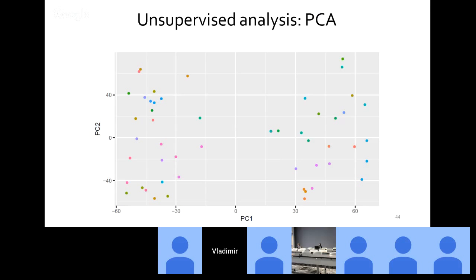And interestingly, for breast cancer, indeed, subtypes exist. These subtypes indeed differ in optimal treatment strategies, and the authors of the manuscript, which provided the data set we're using, annotated these samples using the division into four subtypes: luminal, basal, Claudin-low, and normal-like. So the number of subtypes is 4, but clearly we see here only 2 groups.